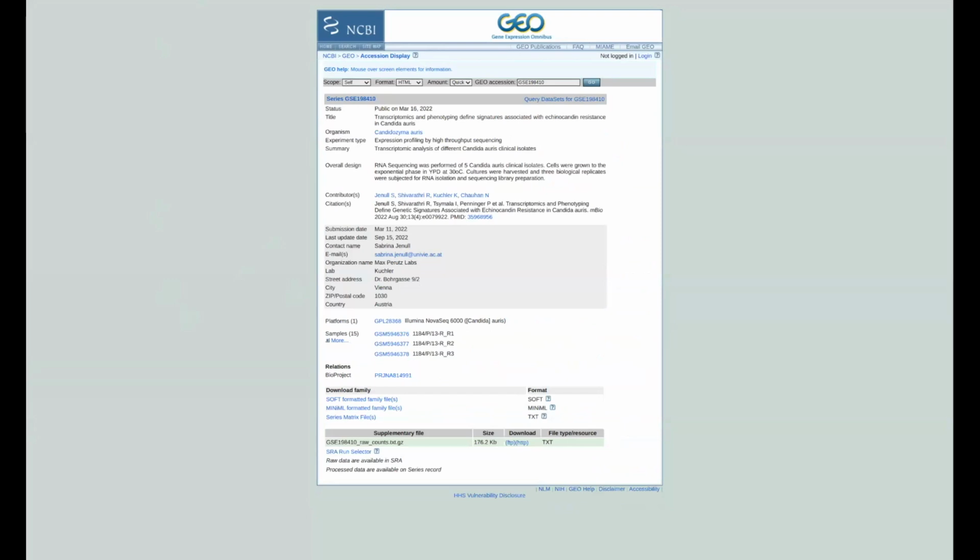I should mention that one of our requests from our funder, NIAID, and in general one of our goals, is, if you remember when I was showing the list of external resources, taxonomy, UCSC genome browser, NCBI datasets, we're also going to hook in the GEO data sets for a particular species. So you can see all the data sets that are available from GEO for a given species, for example. Okay, so you get this, and in this case I want to actually rerun RNA-seq.